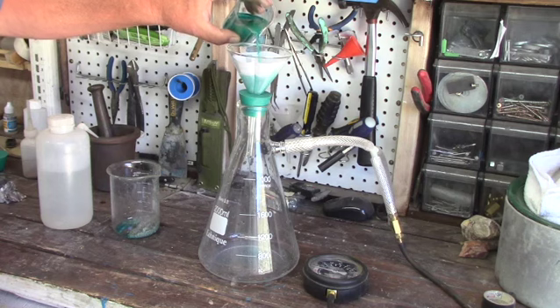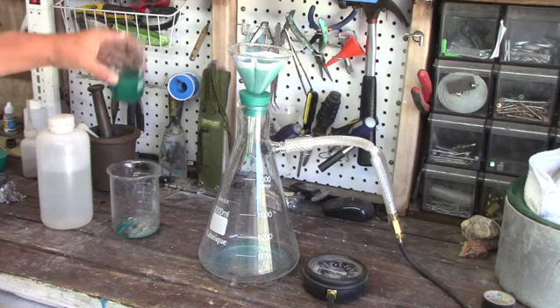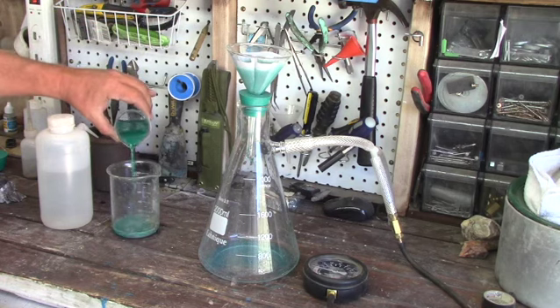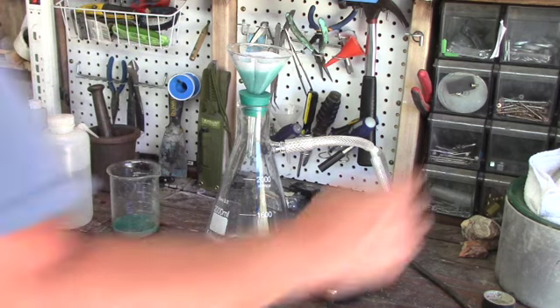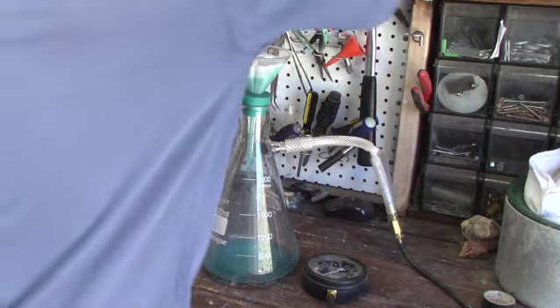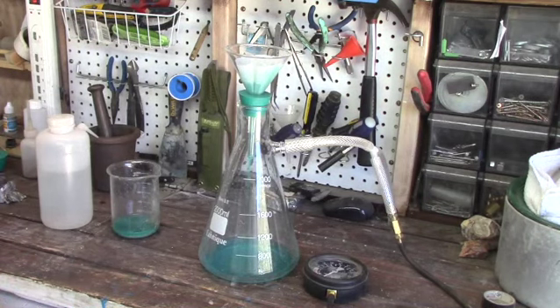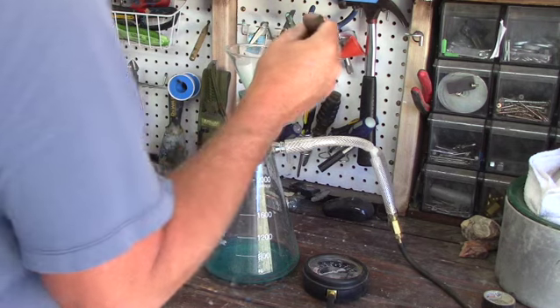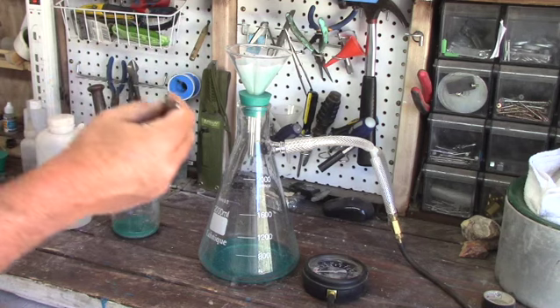Now here's what I was talking about — putting a vacuum flask on with a regular funnel. Eventually the paper filter will start getting sucked down into the funnel, and if you're not paying attention it'll actually suck it all the way through and down into the flask. You can see I'm grabbing it with tweezers and pulling it back up, trying to keep it from going through.